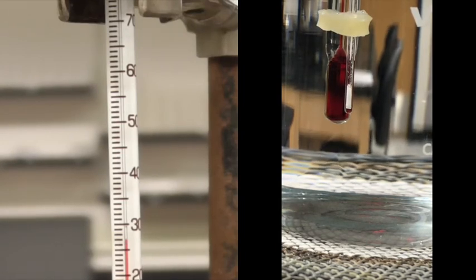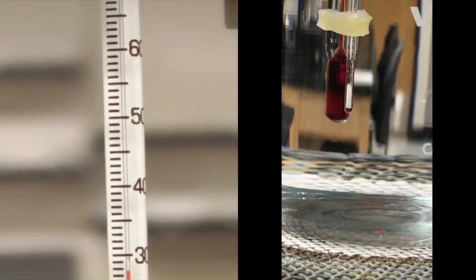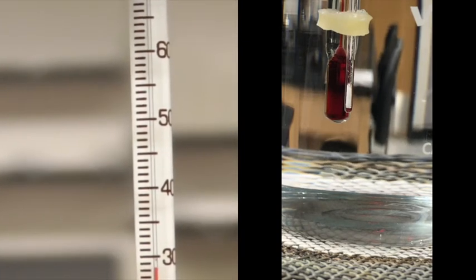Temperature's starting to rise a little bit. I'm going to zoom in. Take just a little bit.